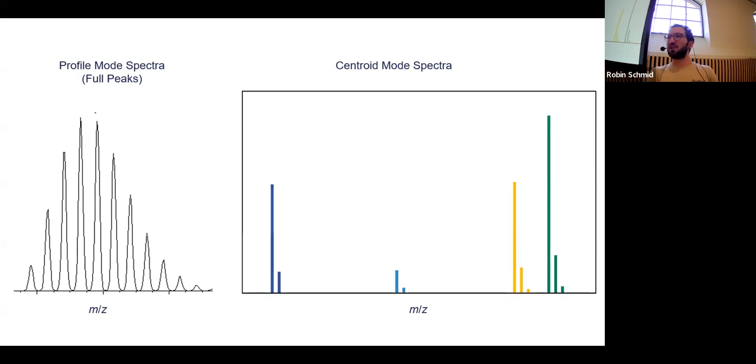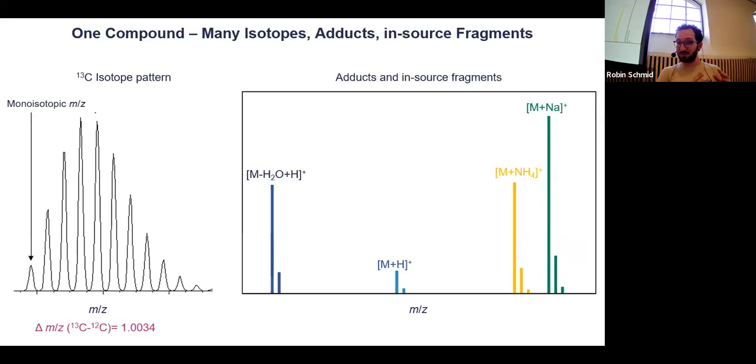There are some workarounds and some fixes, but that's why, in the documentation, if you find that with the vendor that you're using you have some struggles and you find some solution, maybe just put it in our documentation or any documentation that you can find so that people can at least find it. And also we're going to look into mass spectrometry data, so we're also going to find a lot of artifacts, but I would not call those things artifacts. So we have the isotope patterns and we have the different adducts.